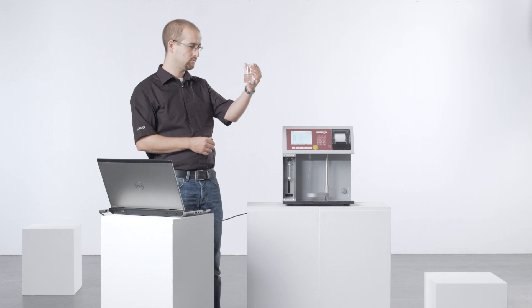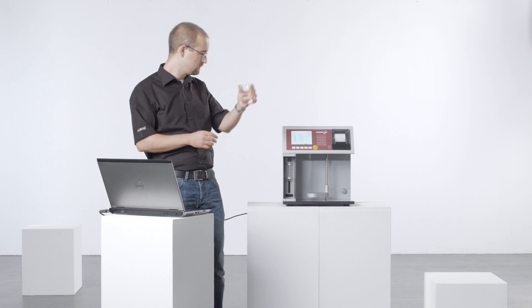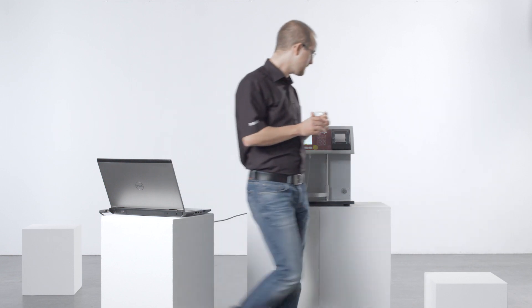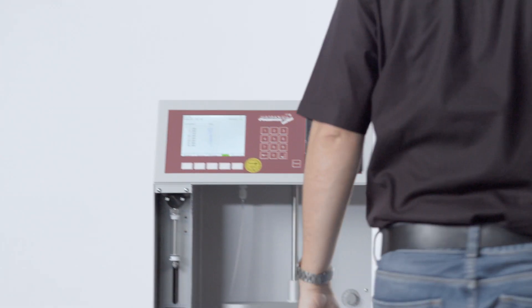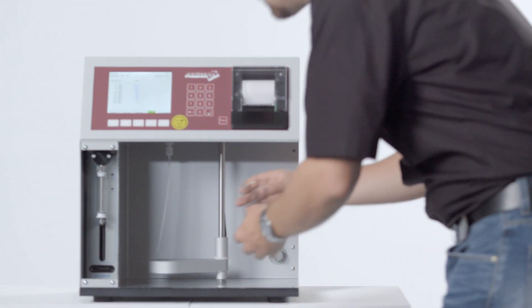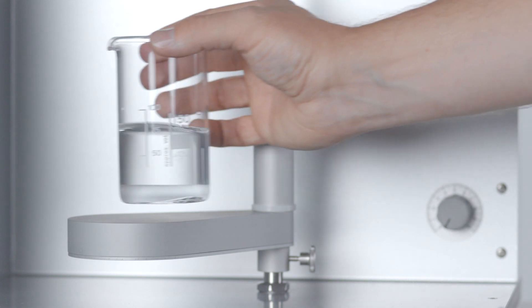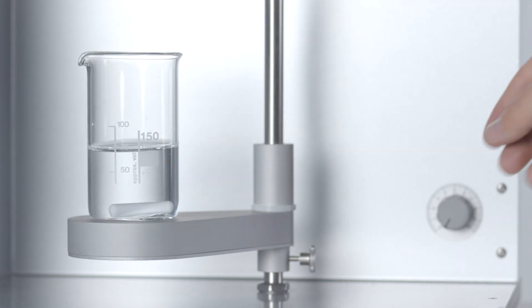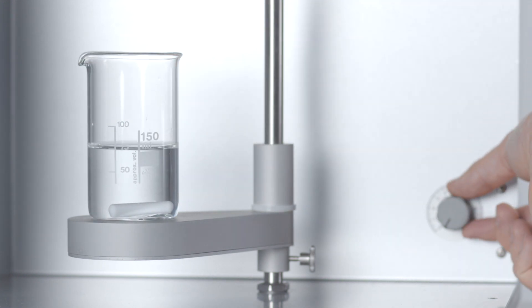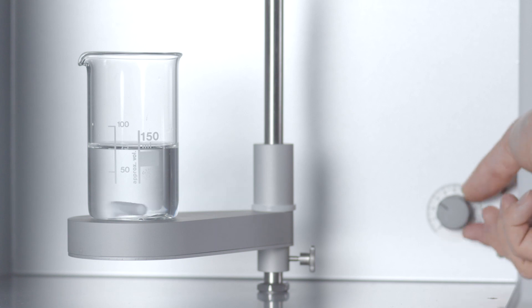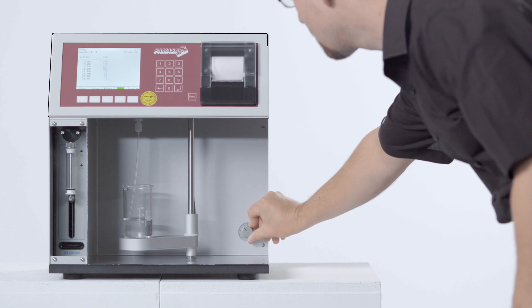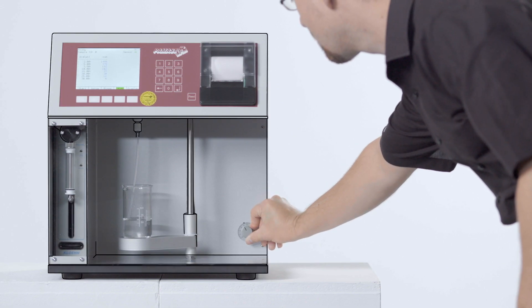Due to its flexibility, an array of sample vessels can be used. An integrated magnetic stirrer guarantees that the particles are thoroughly and homogeneously distributed.